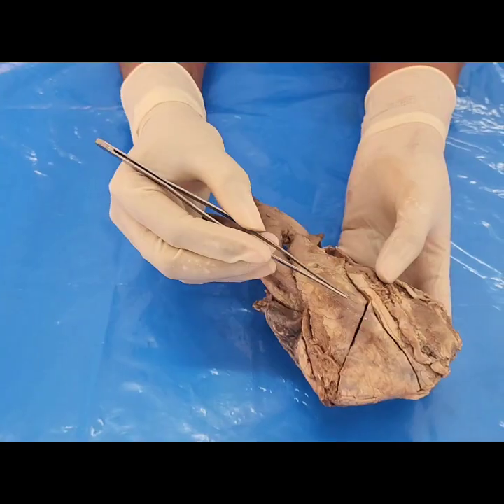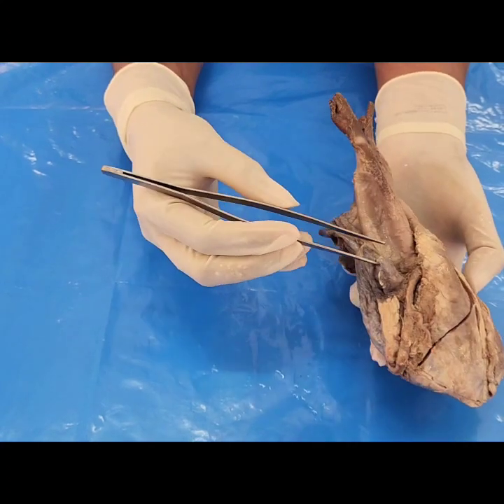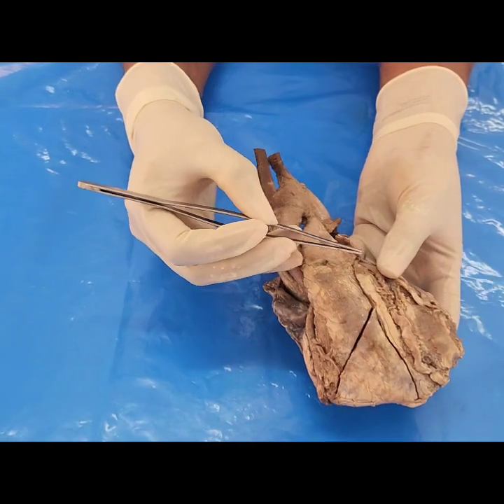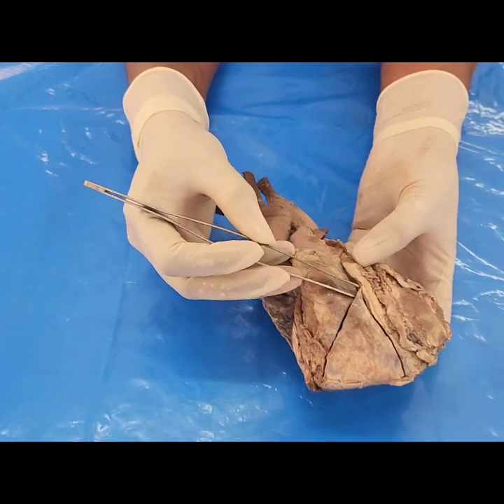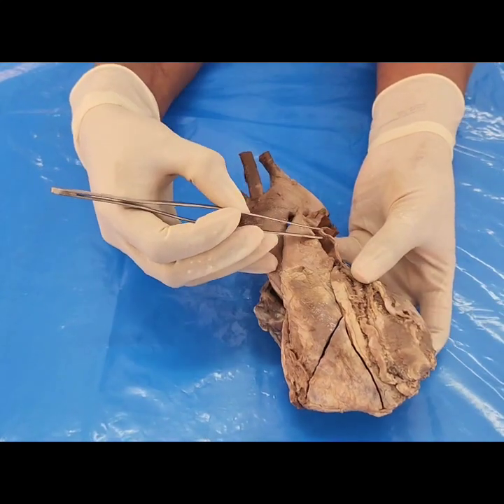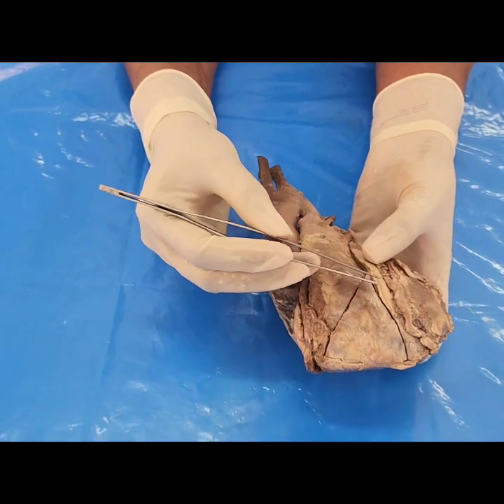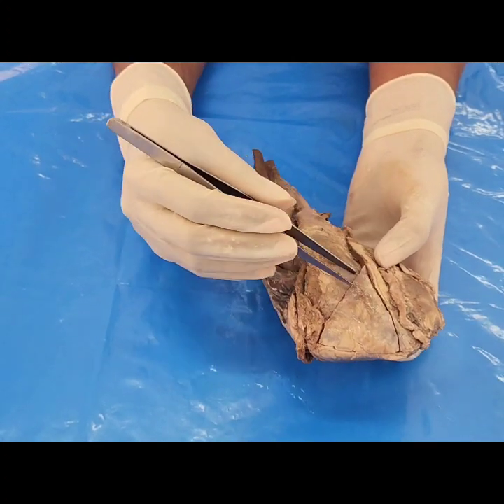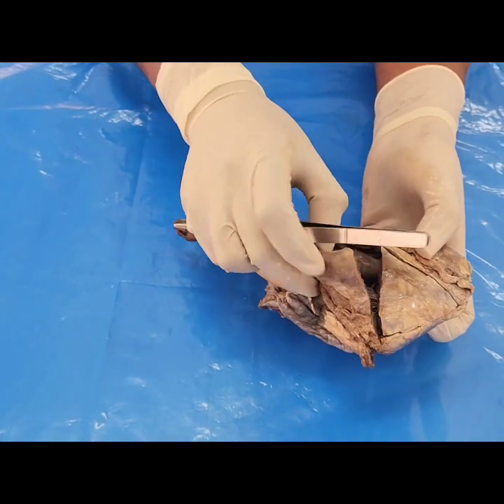Now see the interior of the right ventricle. This is the right auricle. Here you have the right atrium. This is the right ventricle. What we have done is we have made an incision along the pulmonary trunk, and then right to the interventricular groove, and then we have opened the right ventricle here.